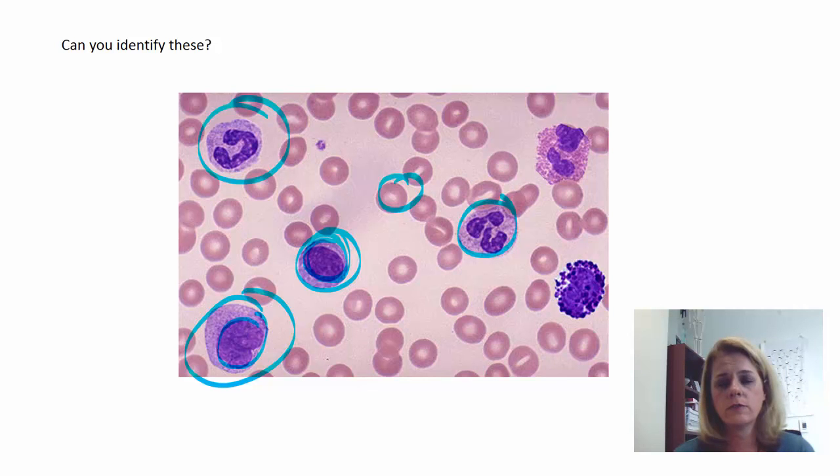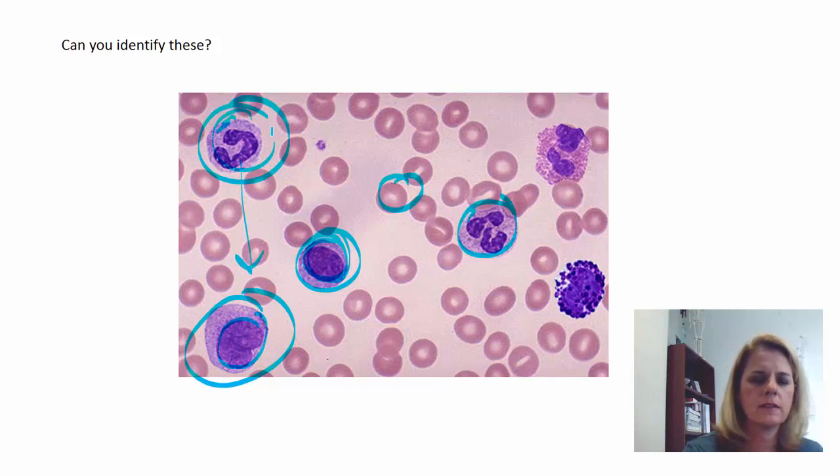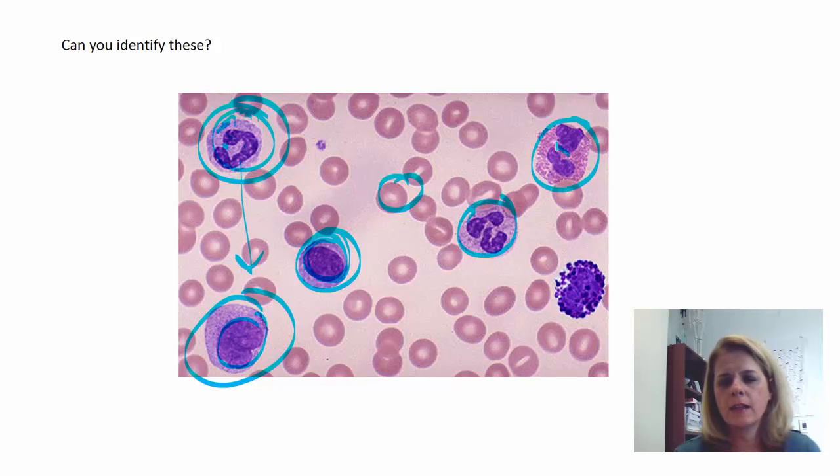This one and this one are neutrophils. All right, see the color? They're that lilac color, and darkly stained nuclei. You may think that looks like a monocyte, but it's not. It's a neutrophil because you can see it's bumpy. Little bumps on it. This one's more red stained, and it's got that bilobe. There's 1, 2 with a little connection in the middle. It's an eosinophil, and the purple bumpy blueberry, that is your basophil.